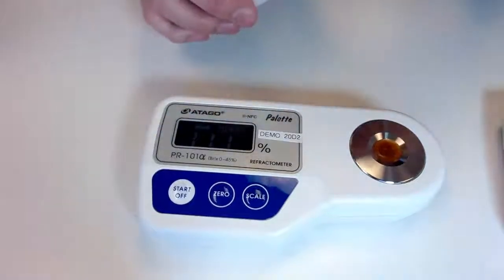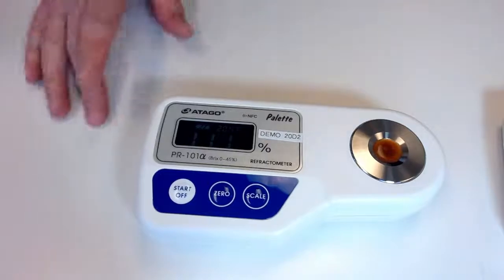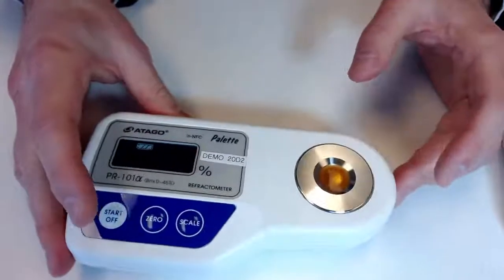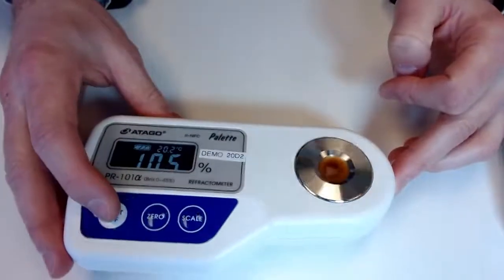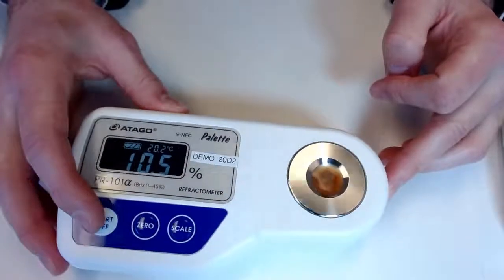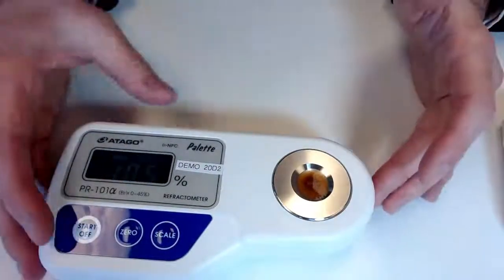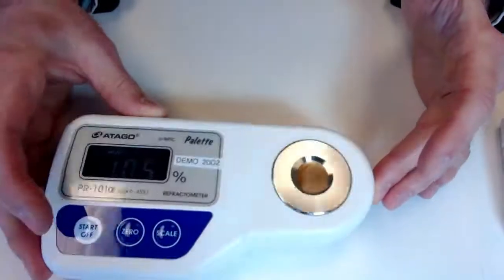I did want to mention that because there is some confusion out there about Brix and what kind of measurements entail, really this is going to look at the contents of sucrose in an aqueous solution. However, you are going to have to factor in other dissolved solids using these measurement principles. So something to keep in mind, especially in cases like this where you have a hot sauce, there's many different things going on, competing acids, sugars, whatnot. So that is going to be reflected.